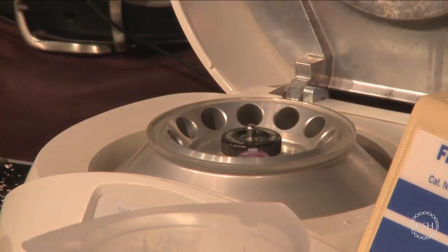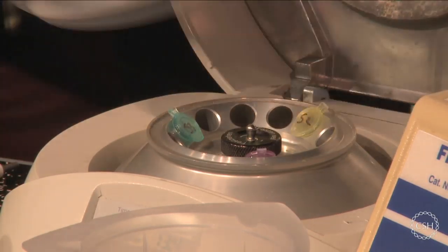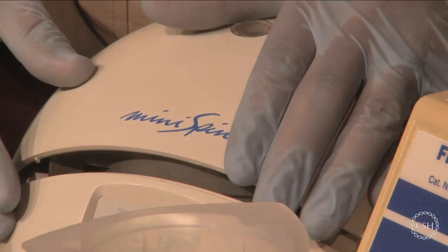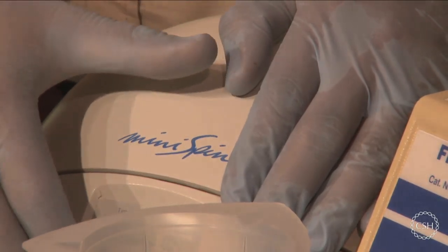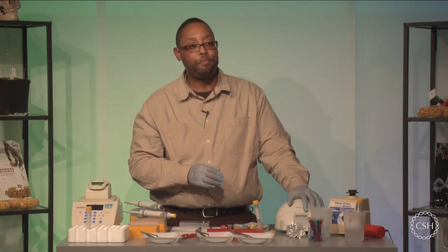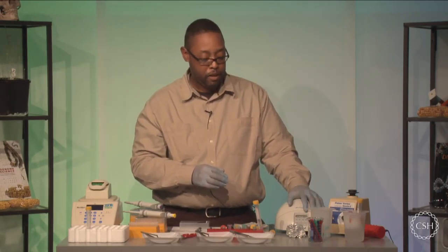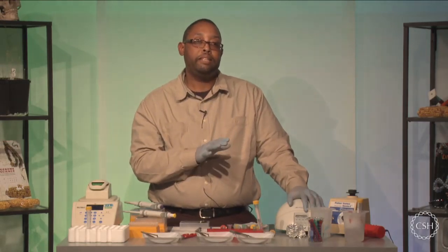So I'm going to place our test tubes back into the microfuge in a balanced configuration and spin them briefly. You only need to do this for about 1 minute or 30 seconds, but you need to exceed about 8,000 RPM. What this is going to do is make sure that we pellet our resin down to the bottom of the tube.